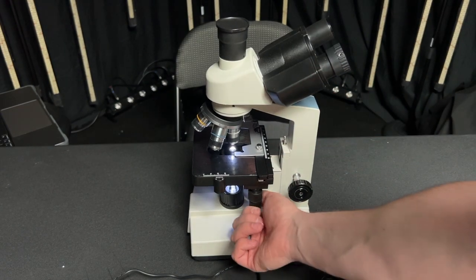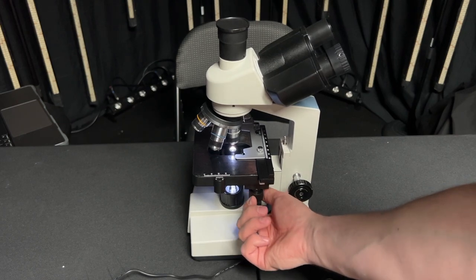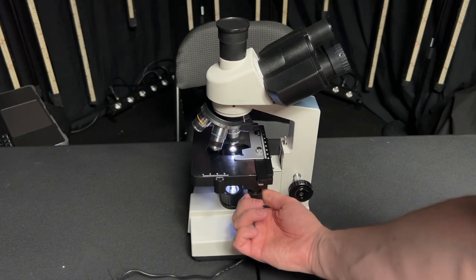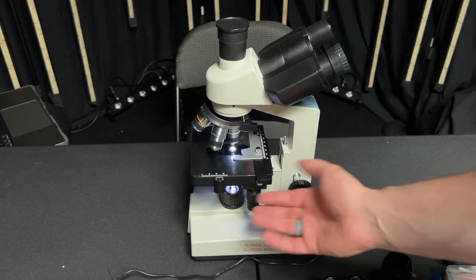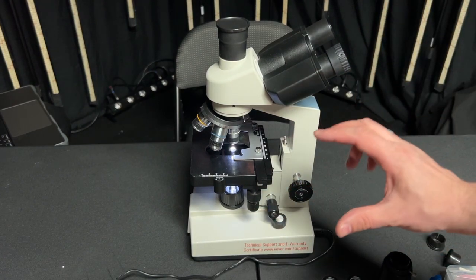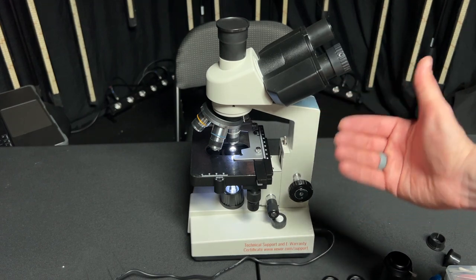You also have adjustments here. For example this one moves the tray left and right and it's also got a forward and back adjustment which means once you have a specimen in and you're looking through the microscope you can use those knobs there to really move it around very carefully and dial it into exactly what you want to look at.